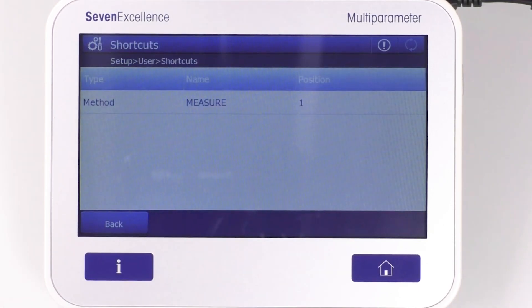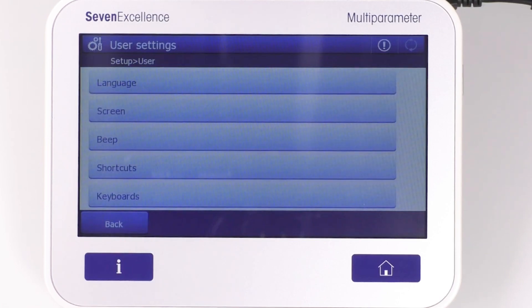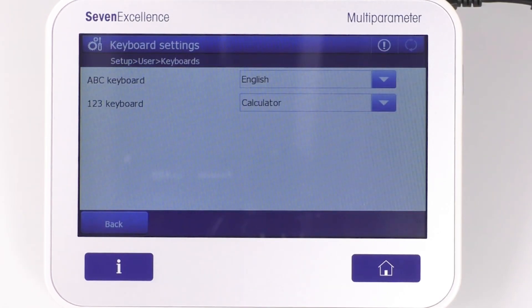The Shortcuts menu will show you the list of all the shortcuts defined for the logged-in user. You can also delete shortcuts from this menu. In the Keyboard section, you have the option to set the keyboard language and modify numeric keyboard settings.